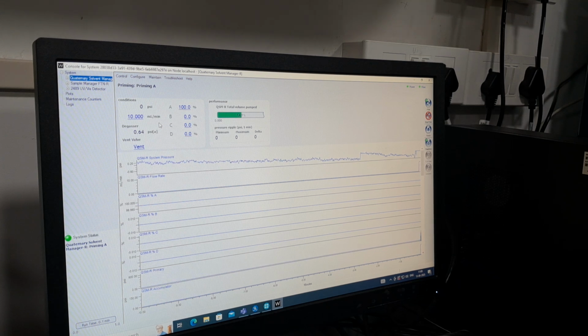The flow will be collected here, and that you can see also. Once it starts, the flow comes from the tank. This is the drain line. The pressure is zero. The flow comes from here. So if it is going properly, the pumping is at the correct point.